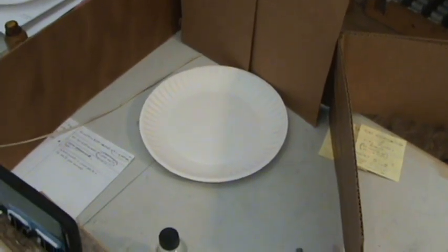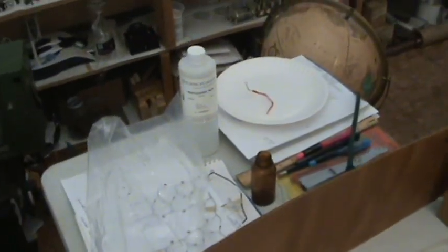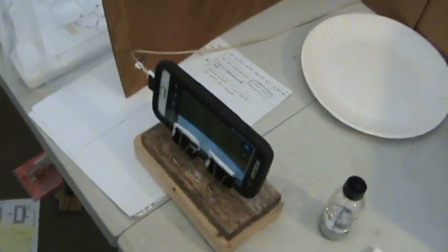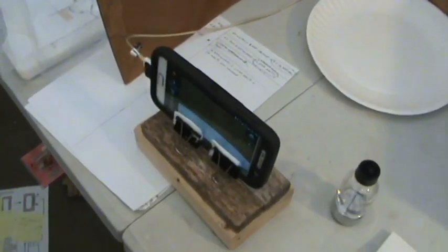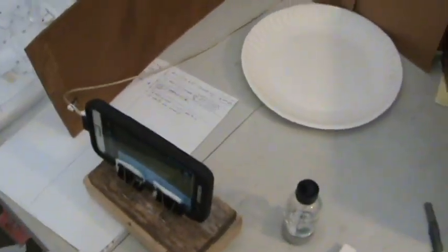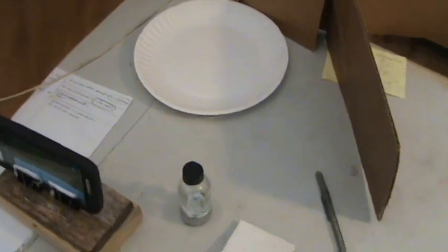It's not easy, as I see other people trying to do it. I'm going to attempt it today. I got some hydrochloric acid, and I got my cell phone set up here with Time Lapse It Pro software application — first time I'm going to be using that. We'll see how it goes.